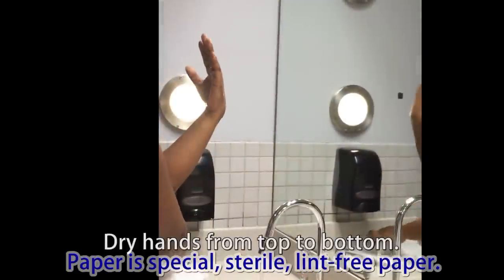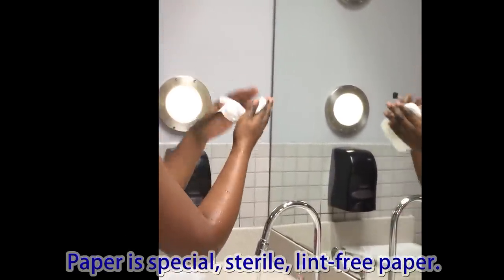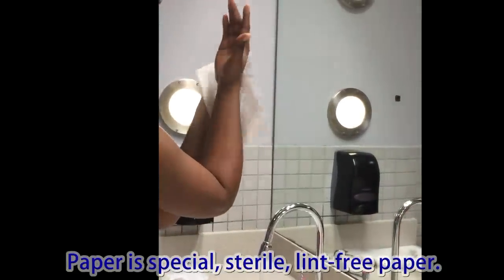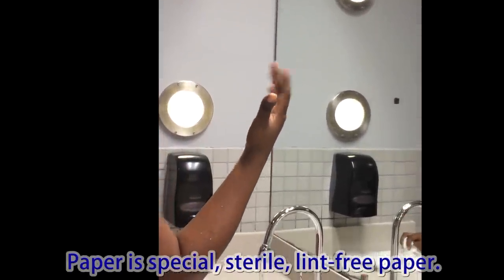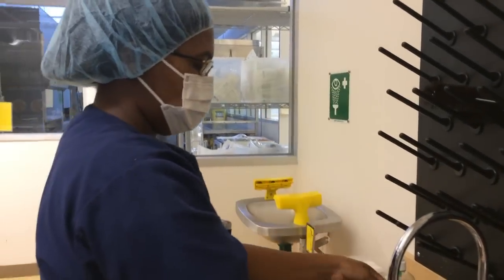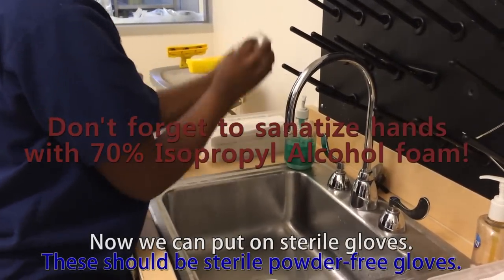Dry hands from top to bottom. Now we can begin to put on sterile gloves.